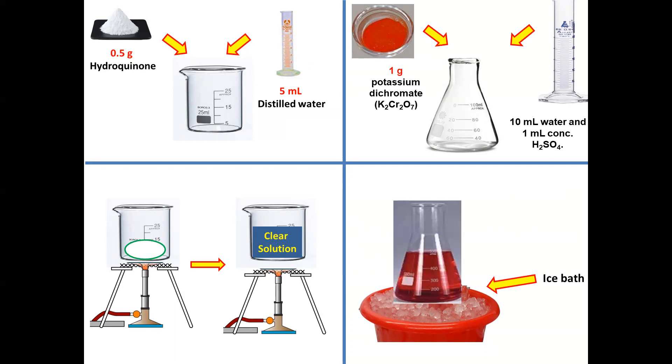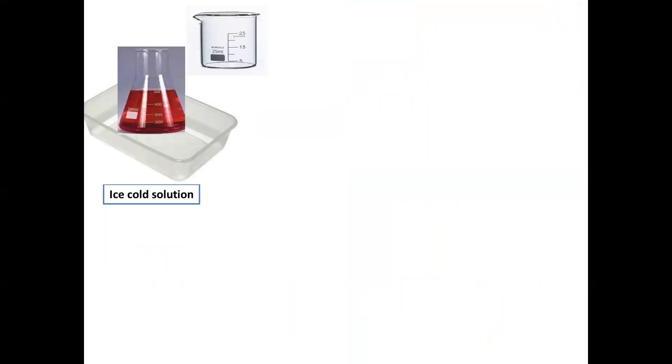Now place the conical flask on ice bath. To the ice cold solution, add drop wise clear solution of hydroquinone.